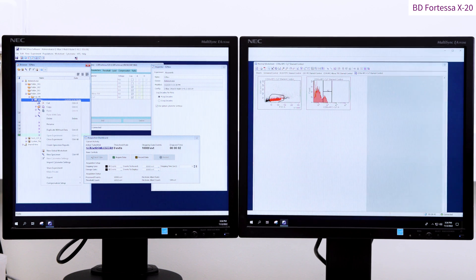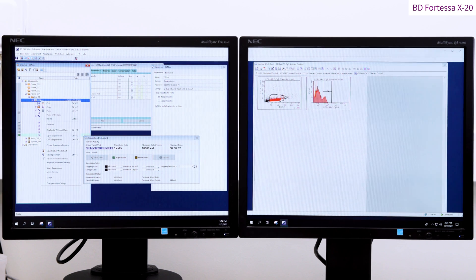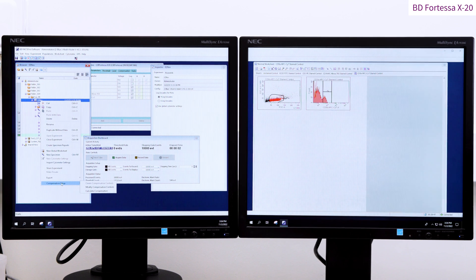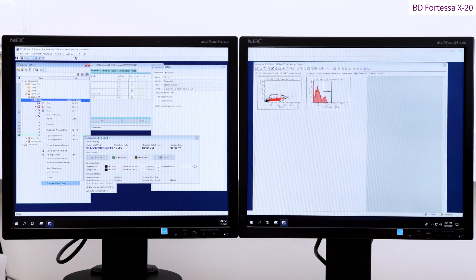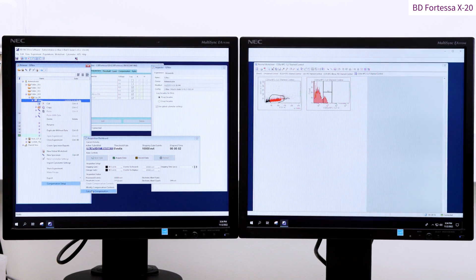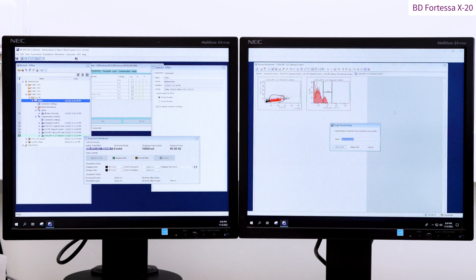Once all the P2 gates are properly allocated, right click on the experiment folder, go to compensation setup tab and press calculate compensation. The single stain setup table will appear. Choose the link and save option.